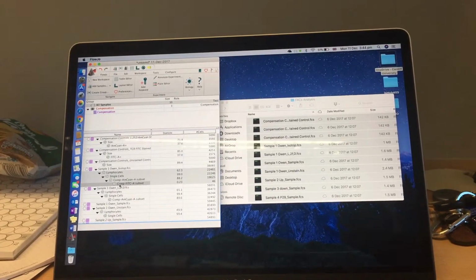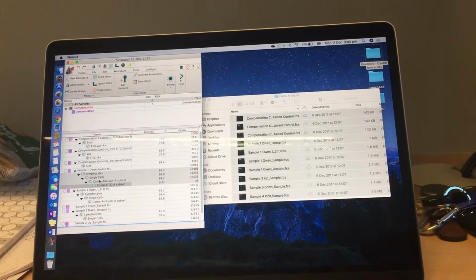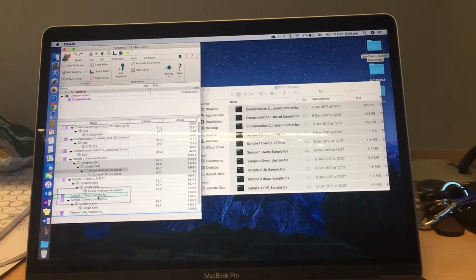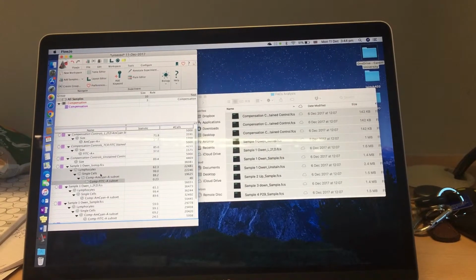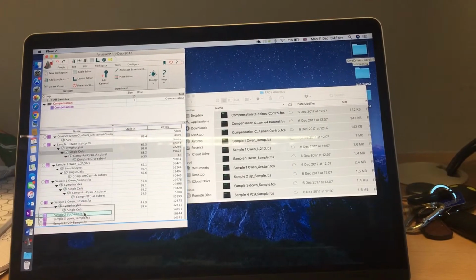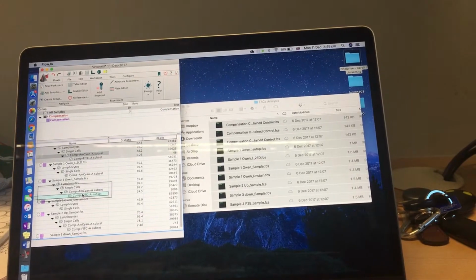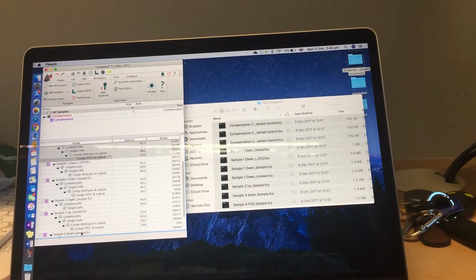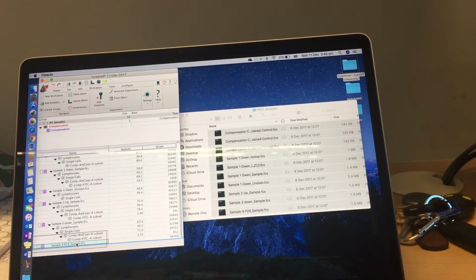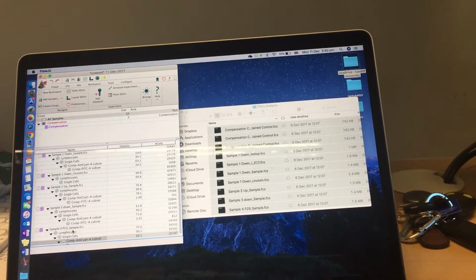Now drag that to all of your experimental conditions. To each. Like sample 1. And drag it again to sample 2. Drag it again to sample 3. And now you can analyze it on the layout editor.